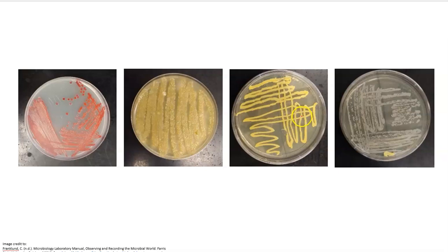It also looks here like they may have pulled too much bacteria from each quadrant over. Typically, when we pull from the previous quadrant, we like to only go through a small section and maybe pass just once or twice.